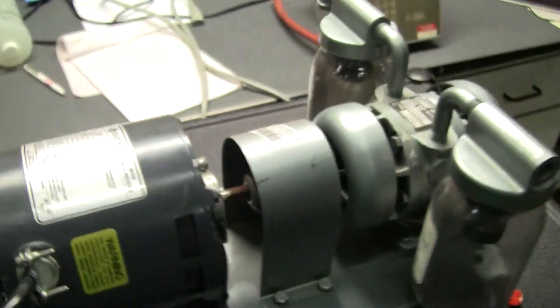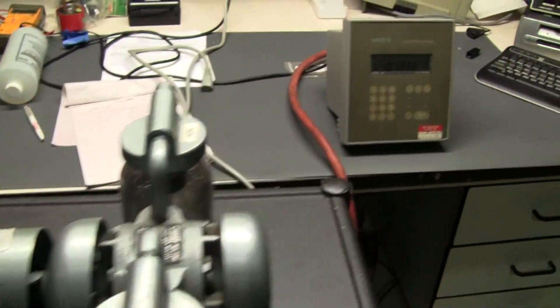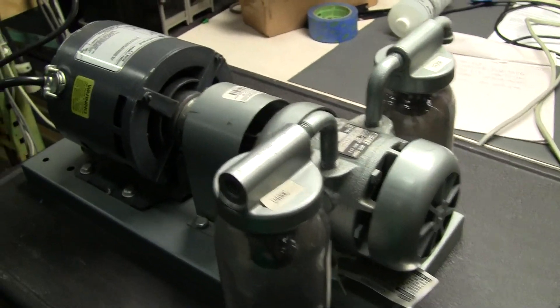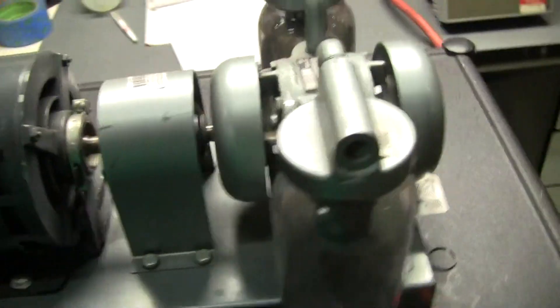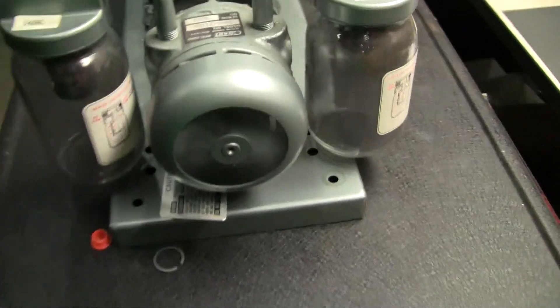Let's turn this pump on. This pump should pull down to about 150 millibar. I can see it running, drive turning.